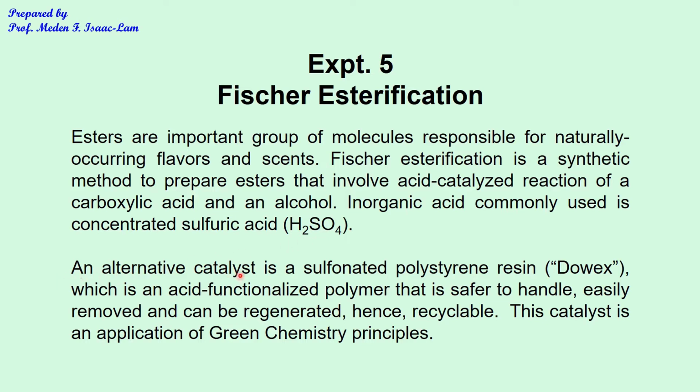An alternative catalyst is a sulfonated polystyrene resin called DOWEX, which is an acid functionalized polymer that is safer to handle, easily removed, and can be regenerated, hence recyclable. This catalyst is an application of green chemistry principles.